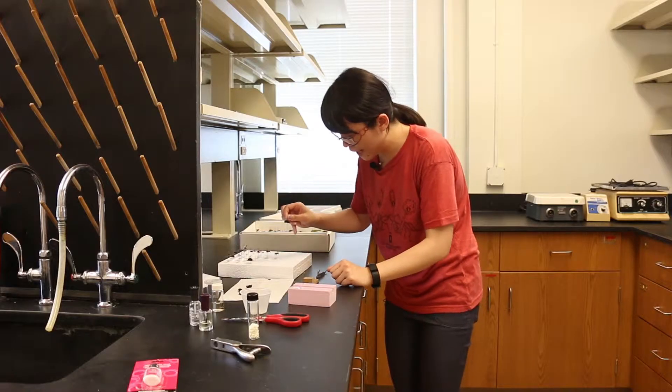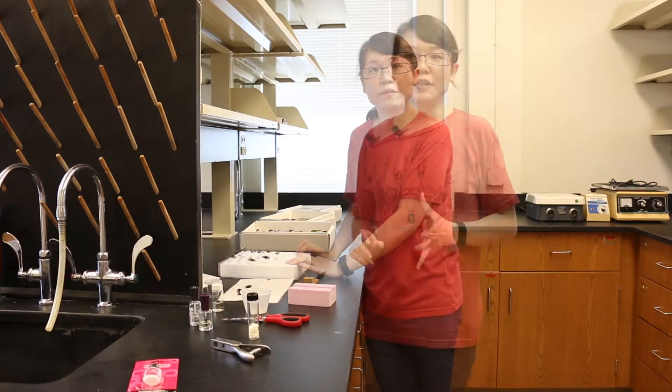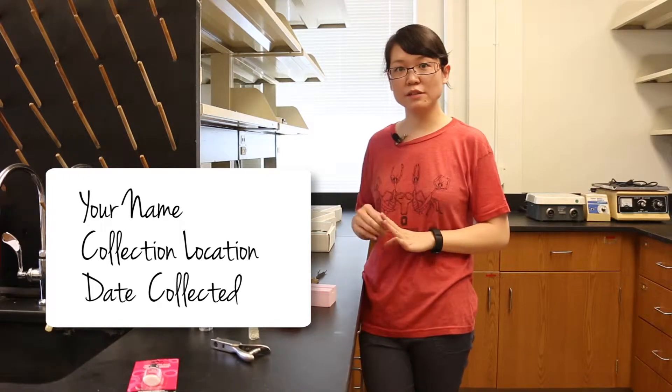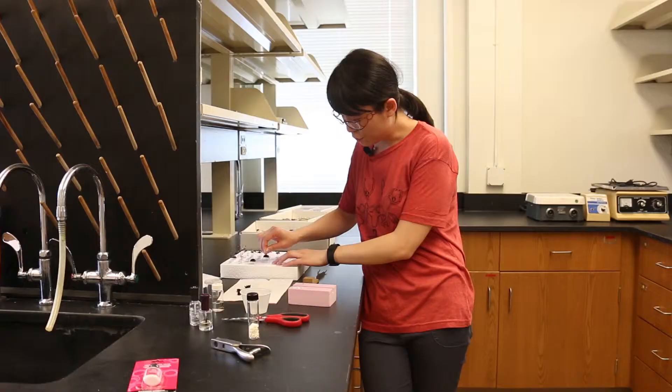That way we can make sure all the insects are at the same height. Then we move the insect and pin onto the styrofoam. The last very important step is to label the specimen with a pre-made label — the first label includes the collection location, the date when you collected it, and your name. Move them into your collection box and there you go, you have your first pinned insect specimen.